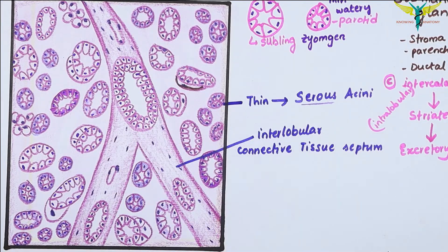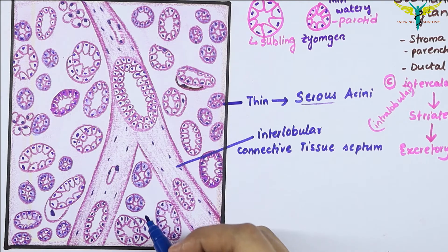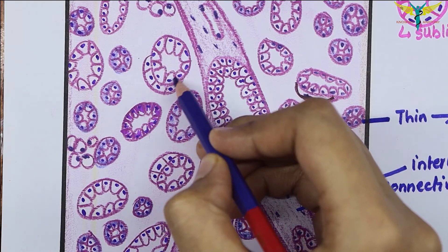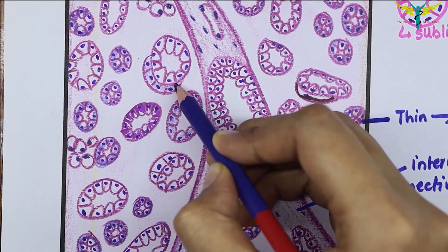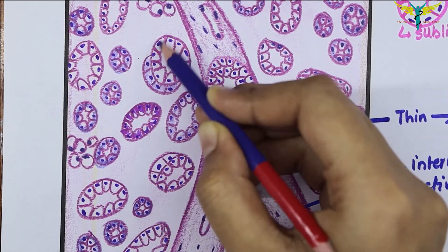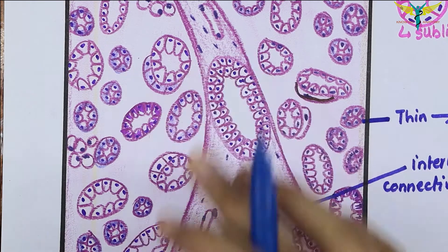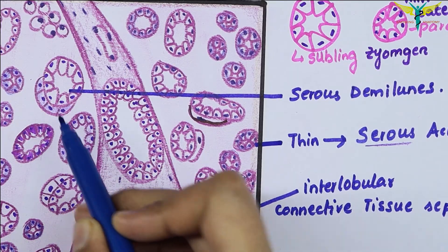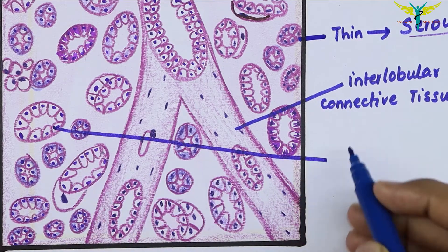Some serous cells are frequently located at the periphery of the mucous acini in the form of a crescent shape, and these are called demilunes. You can see the mucous acini here, with some serous cells present in crescent shape towards the periphery — this is called the serous demilune. So this is the mucous acini with a serous demilune.